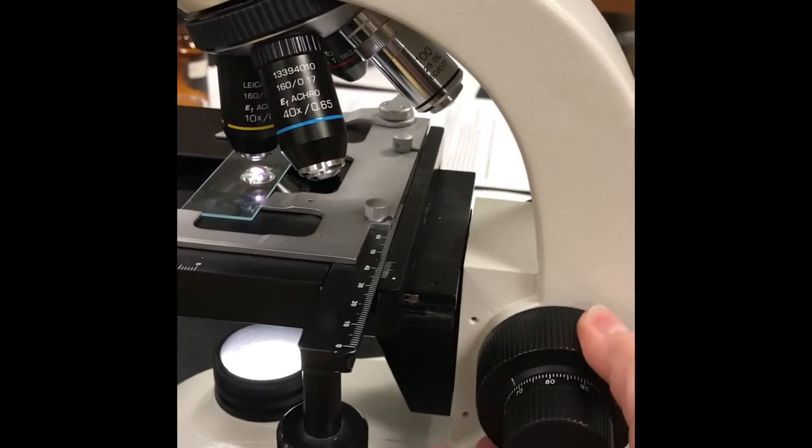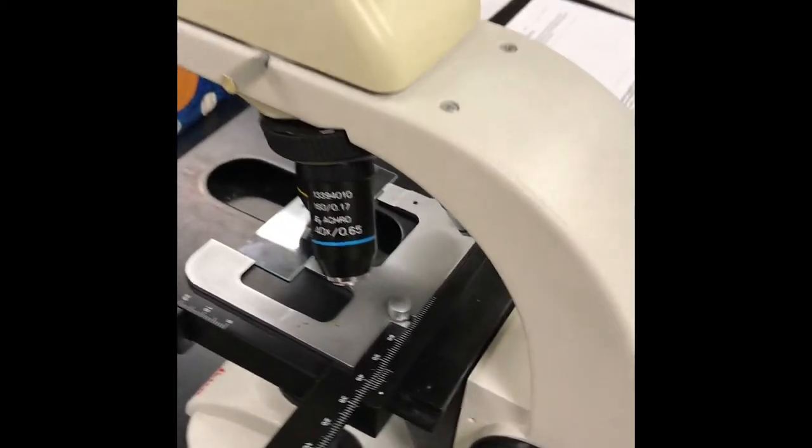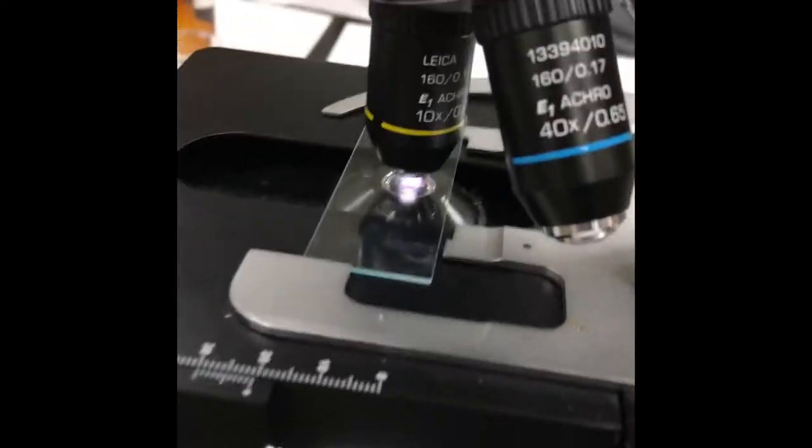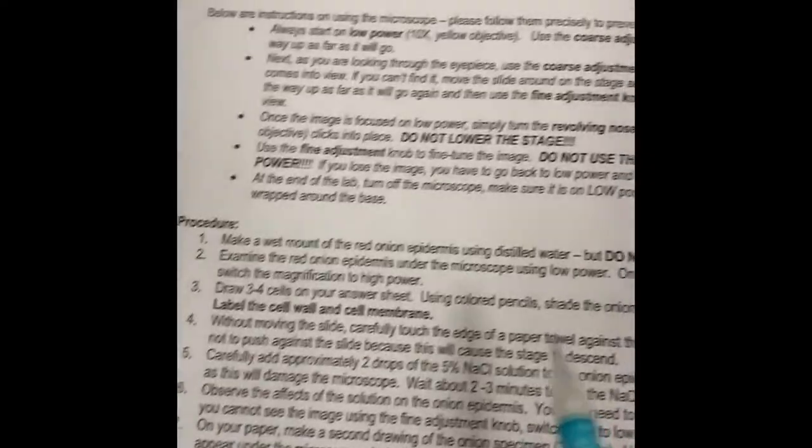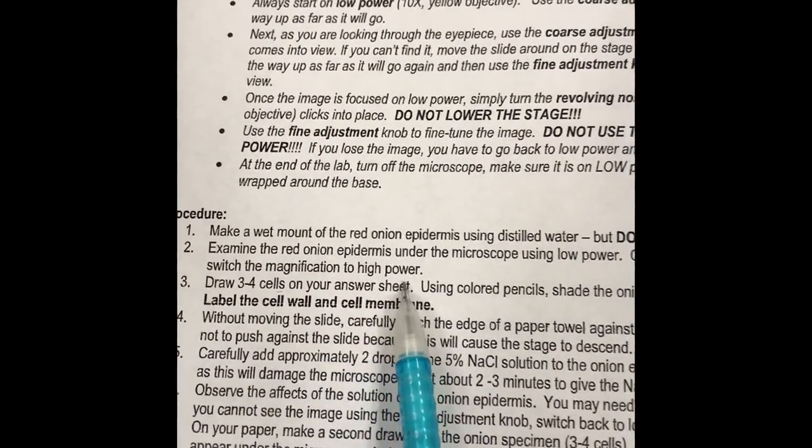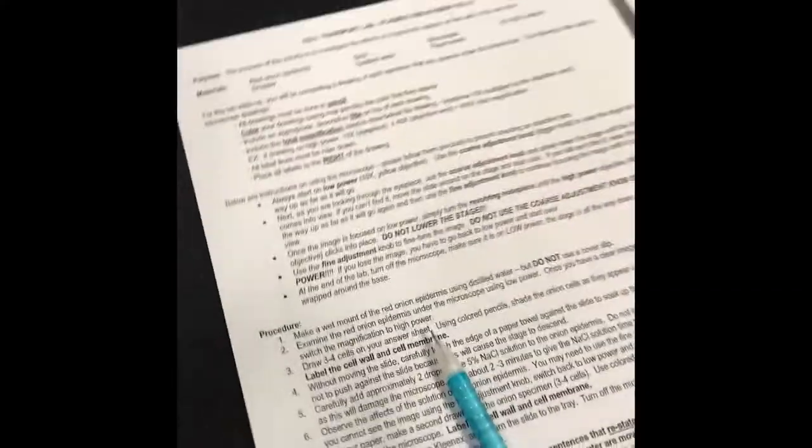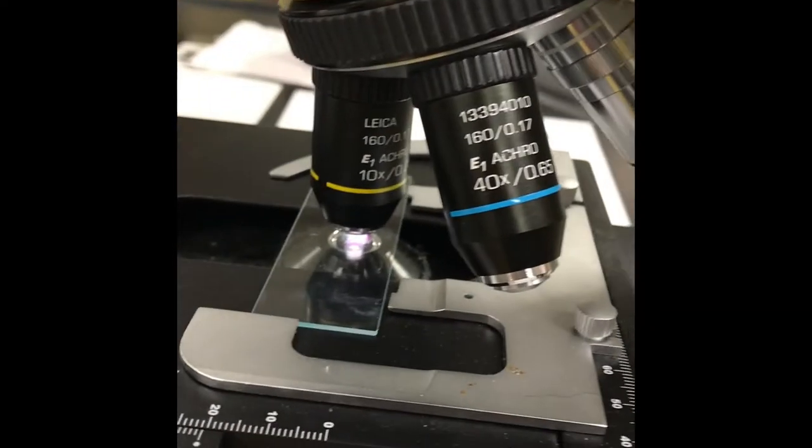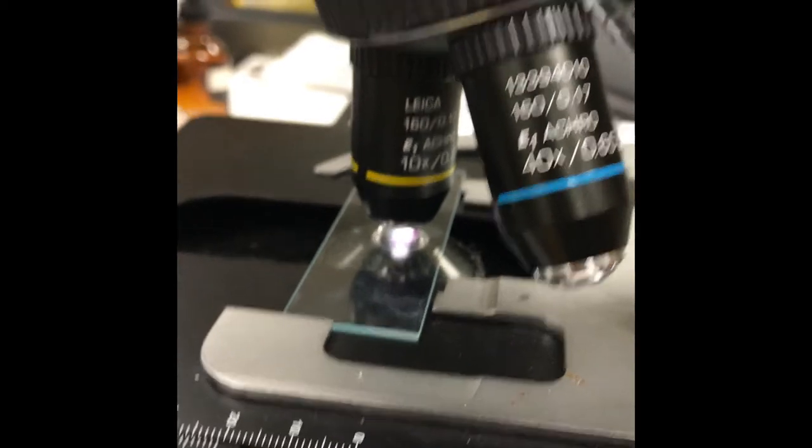I have it focused on 10x now. I know the directions say to switch to high power, but we're not going to do that because we're not using a cover slip. I want you to make your drawings on low power, so your total magnification is going to be 100x, not 400x. We have it on the 10x objective times the 10x eyepiece, which equals 100x.